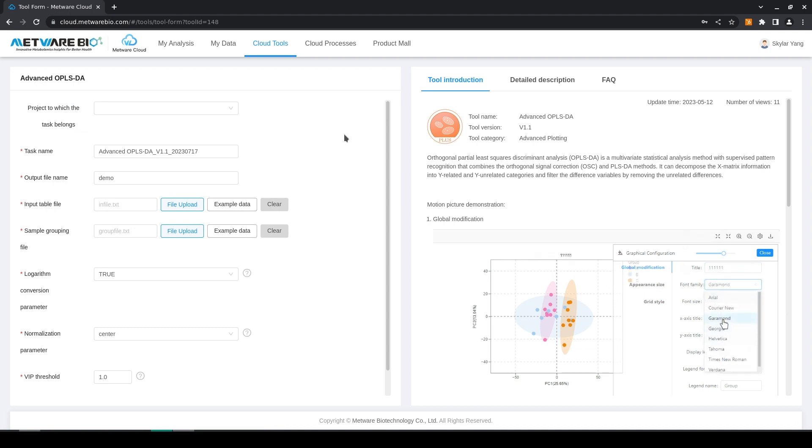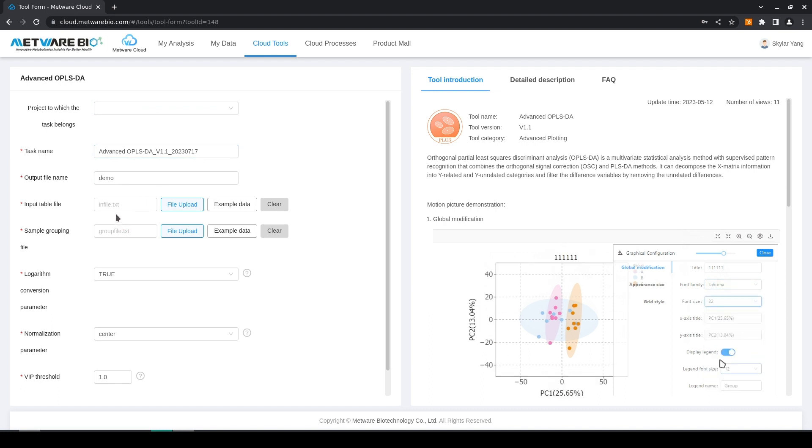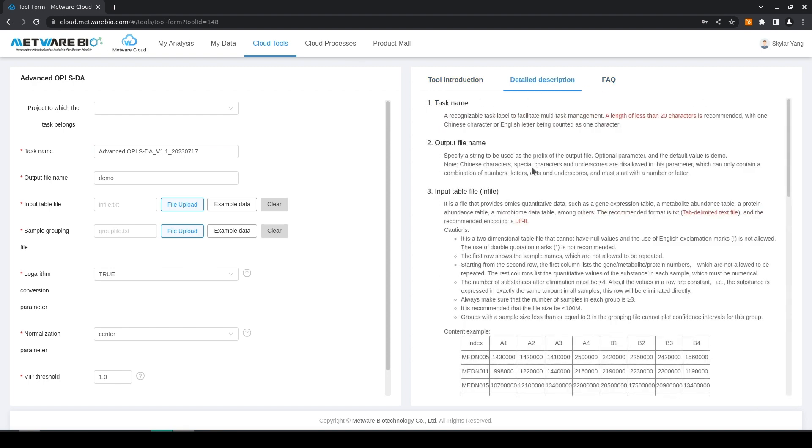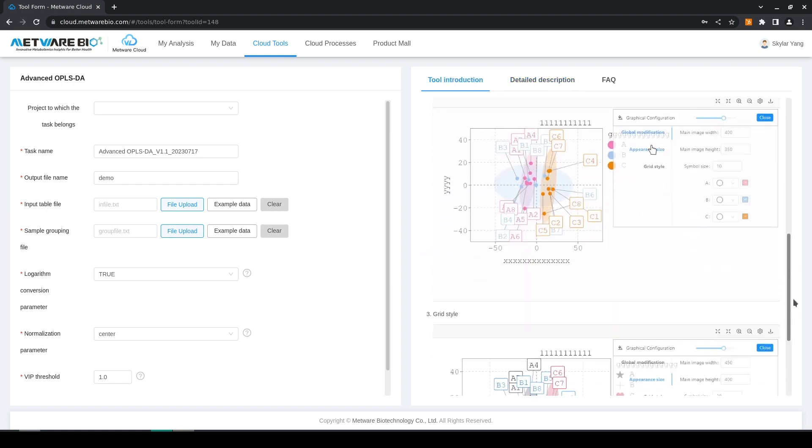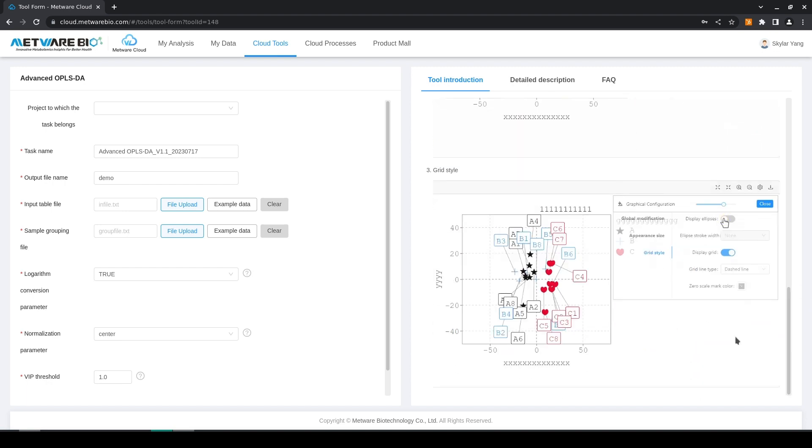On the left we have our entry parameters and where we upload our files, and on the right we have three menus: a troubleshooting menu, a description menu which explains how to use the tool and how the files should be organized, and a brief introduction which also shows how to edit the graphical output.